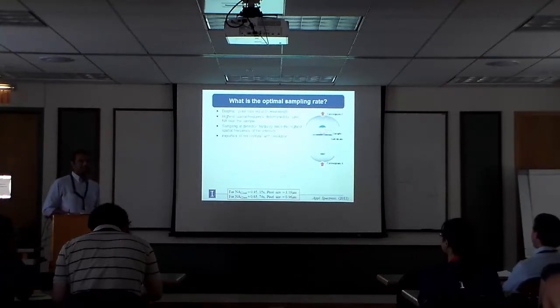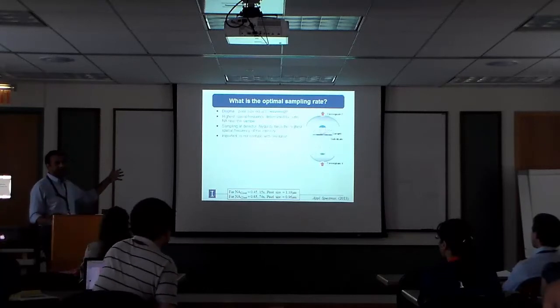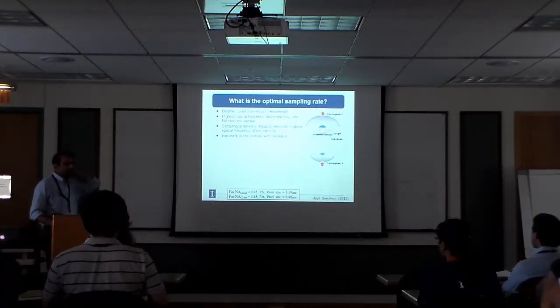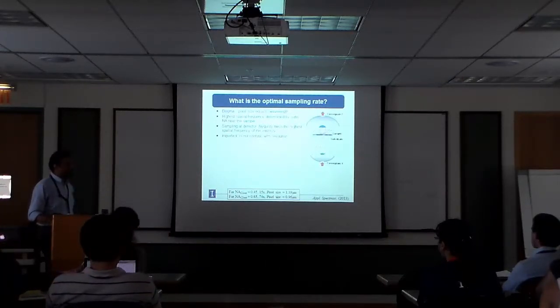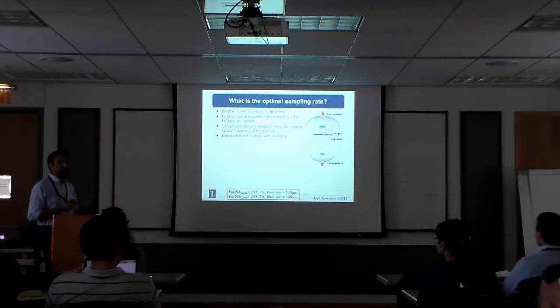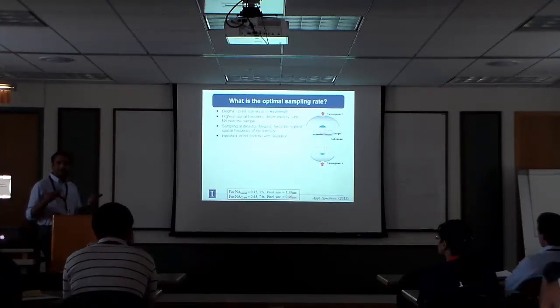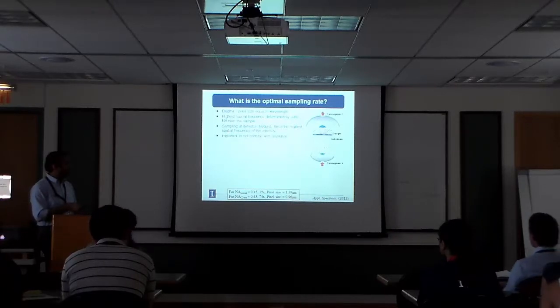But I'll show you some insights that have still come about. We can take a few frequencies, so this is about a 20-day simulation that my student actually did. What we were trying to answer here was this: you've got a sample, you've got all these frequencies, they all interact, and you get some image that comes out. That's great. But what we didn't understand for about 15 years in this field was what happens when this signal comes out. Let me explain it in the most intuitive way. Think of an analog signal that has a certain frequency coming in from the condenser, or this thing downstairs.